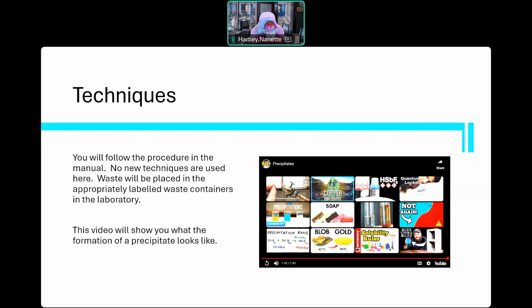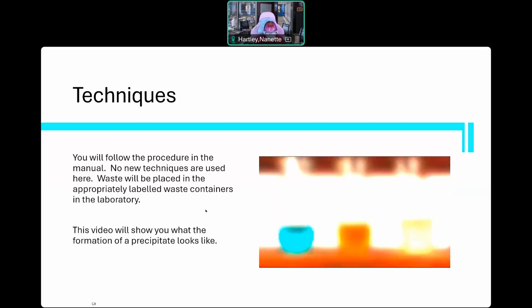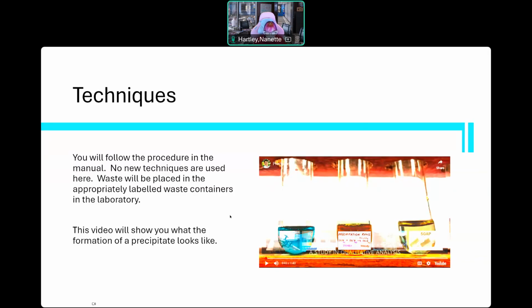So that's what we're talking about for techniques. Now, is there anything else that we wanted to talk about? Oh, one of the other things, make sure that you wash your test tubes before you do these reactions, because if there's anything in them, it can interfere with the reactions that you're trying to look at. I wanted to go to the next slide.